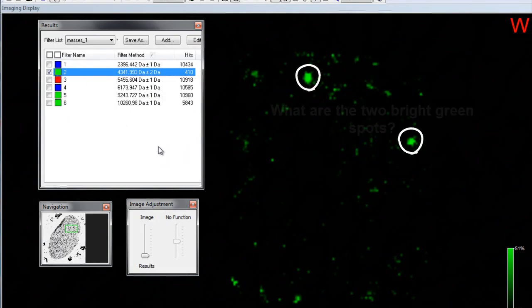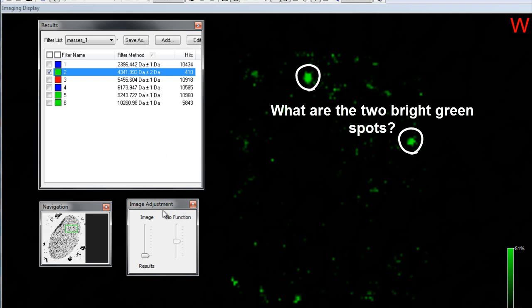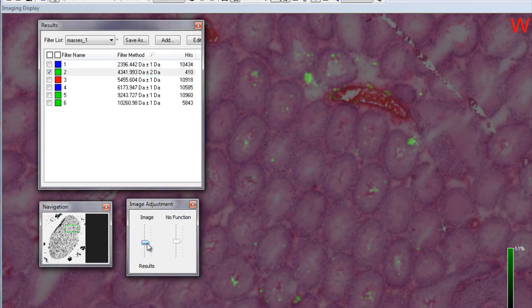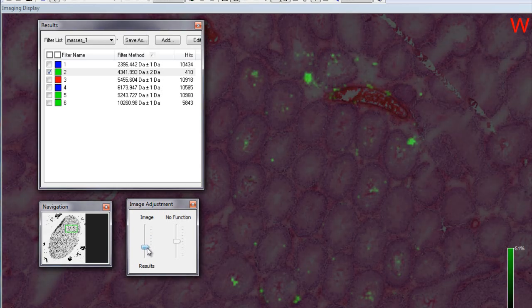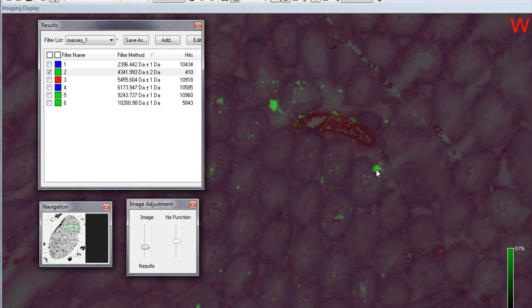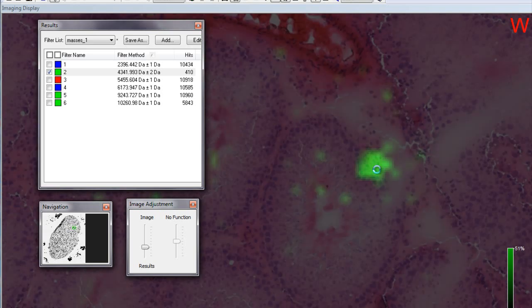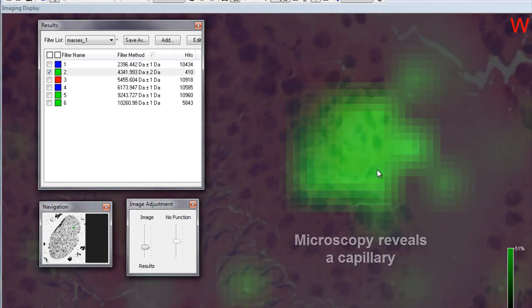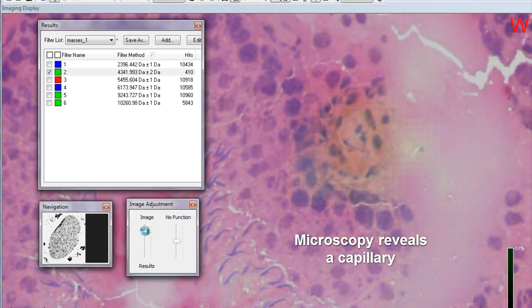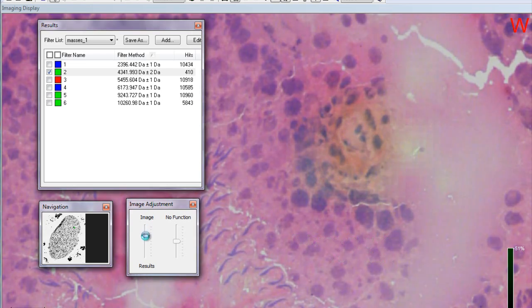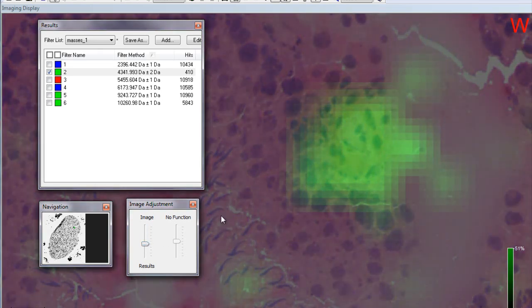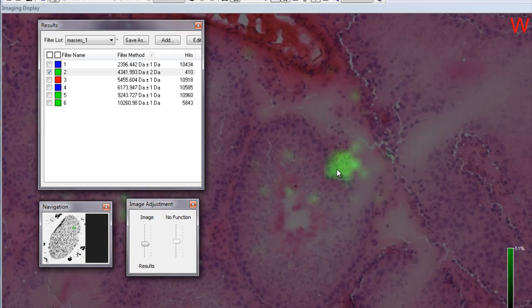Marking of a particular mass signal shows some atypical distribution of the mass. In this case, we are interested in the two bright green spots. As we cross-phase to our molecular histology image, we can zoom in and find that the microscopy reveals a capillary. The presence of the capillary has an exact correlation with the presence of the molecular signal.